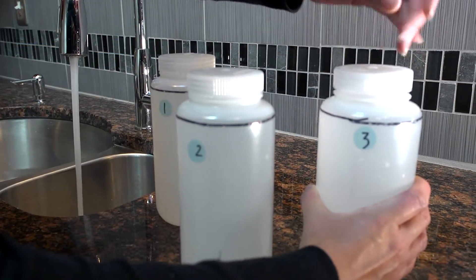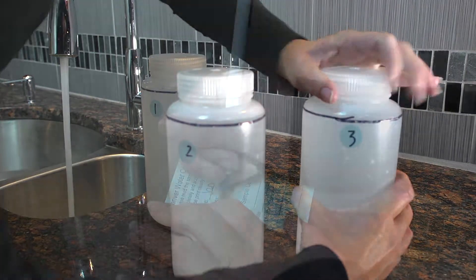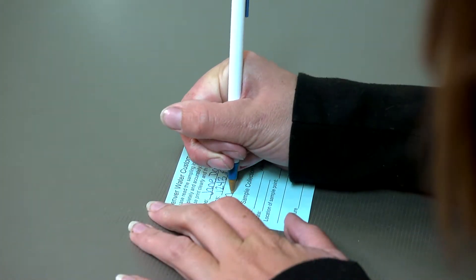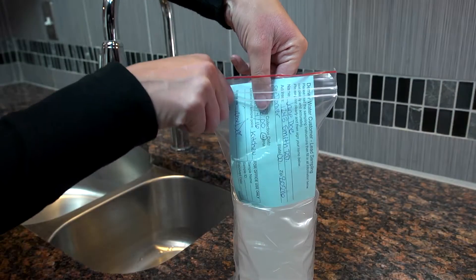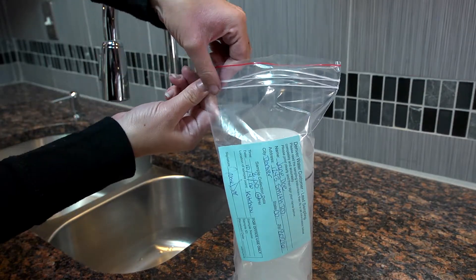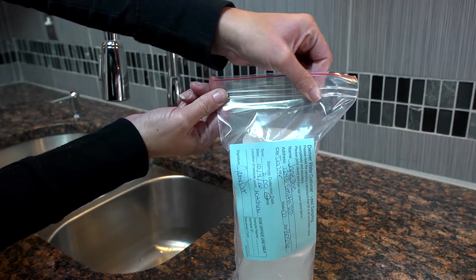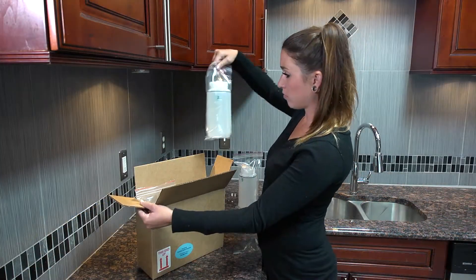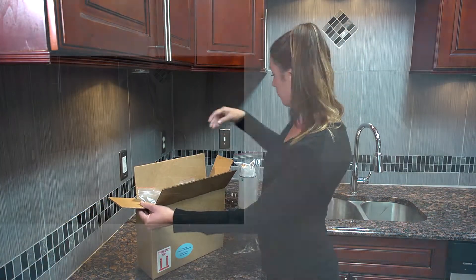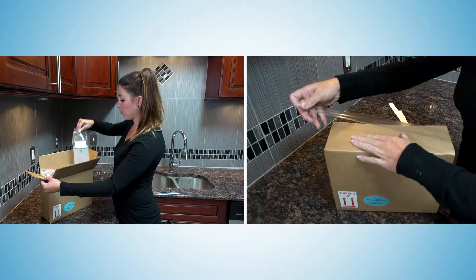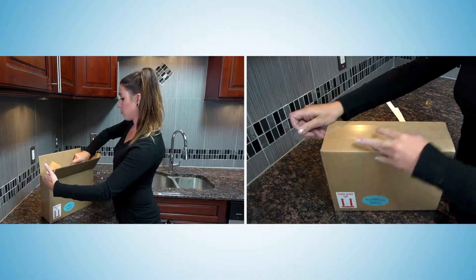When you're done, make sure the lids are on tight. Fill out the blue information card. Place the first bottle into the plastic bag and seal it with the blue card inside. Put the remaining two bottles in the other bags and seal them. Place the bottles upright in the box and tape it shut.